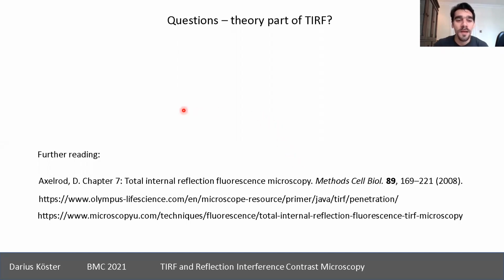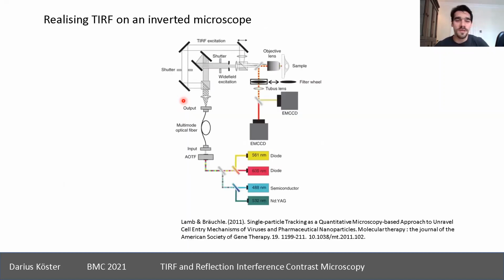All right. So for the next part, I thought I'd go more into the practical parts. What are the components of a TIRF microscope and how to set it up, more or less. This is just a basic technical drawing that I took from a paper, of how a TIRF microscope can be realized.